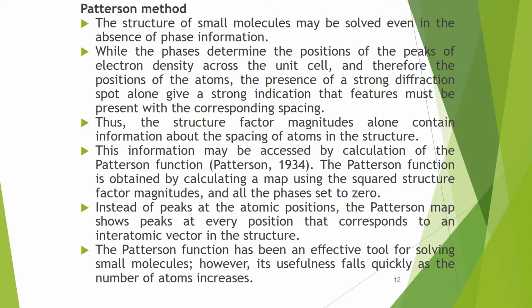That means when the phase determines the position of the peaks of electron density across the unit cell, and therefore the position of the atoms, the presence of a strong diffraction spot alone gives a strong indication that features must be present with the corresponding spacing.